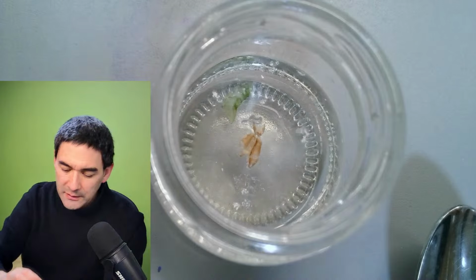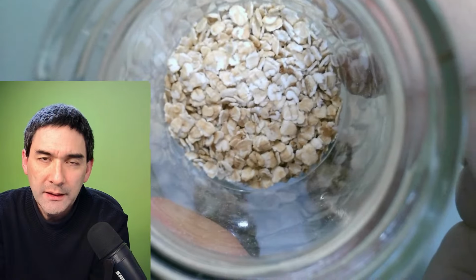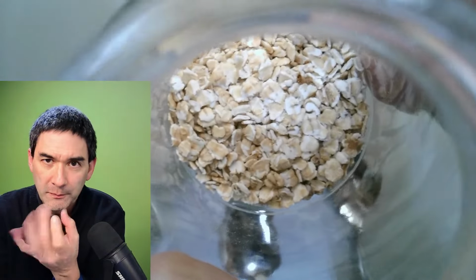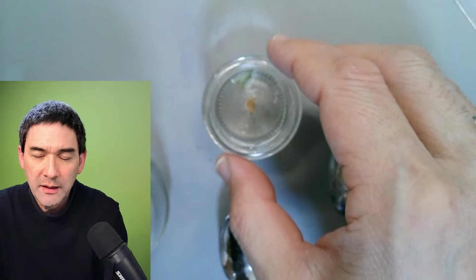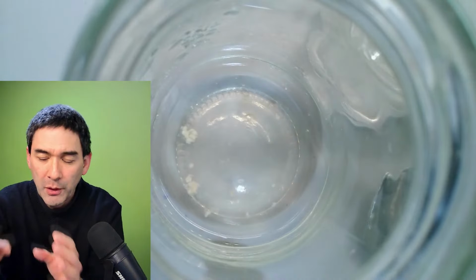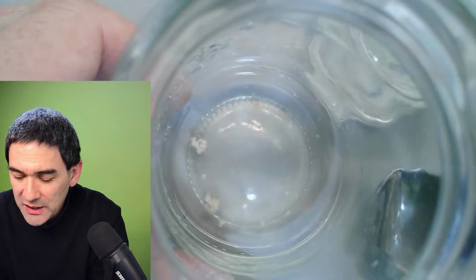I dropped in just regular breakfast cereals, right? And they also work, but they have the disadvantage that they start to fall apart. Then a little bit of overfeeding happens, and the whole liquid breaks apart, and there are bacteria all over the place, not just concentrated around the cereal. And those white things that you see here, these are those.